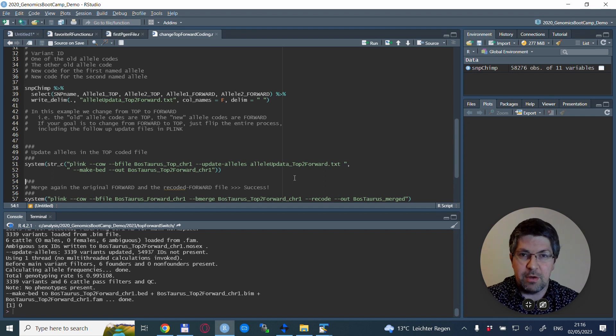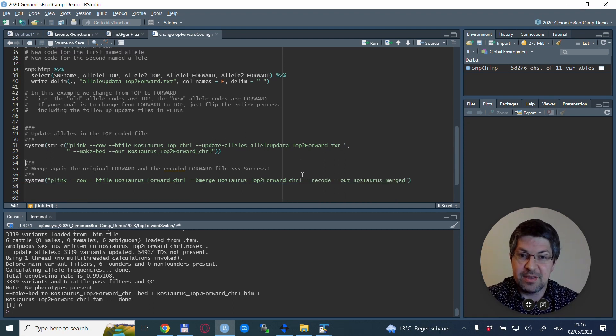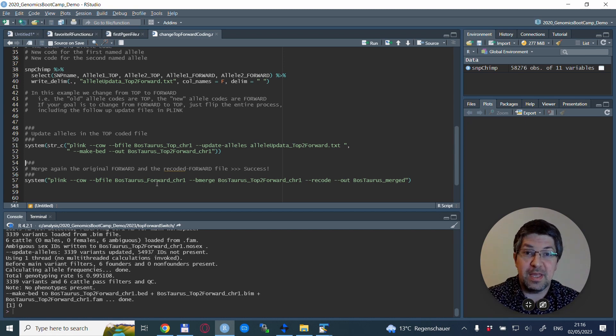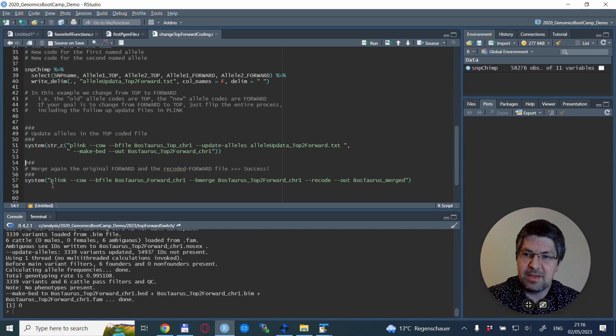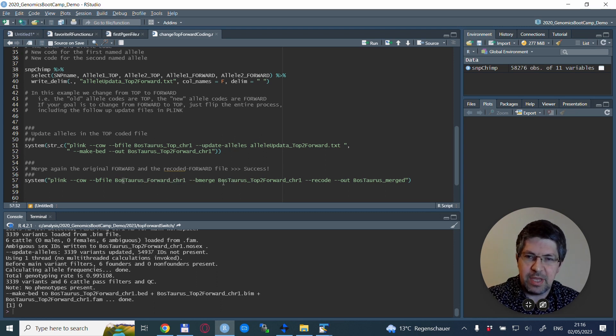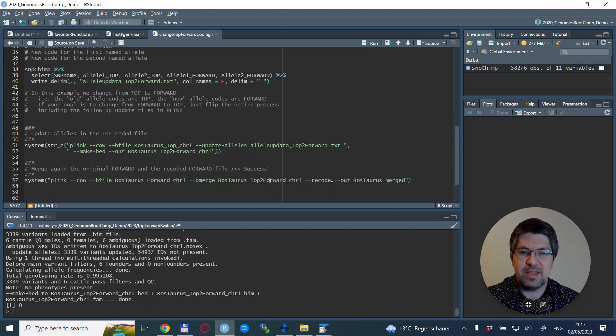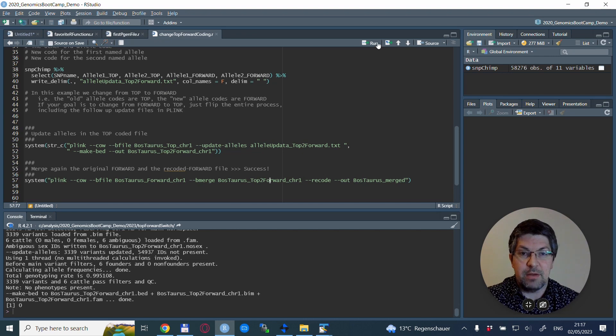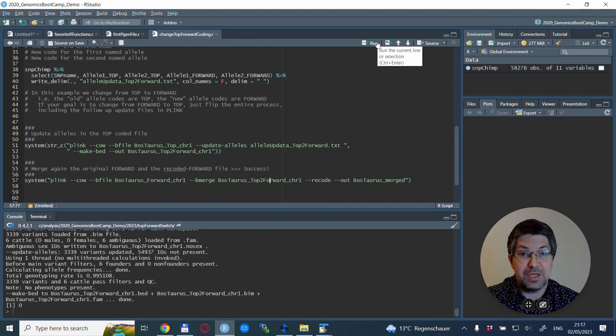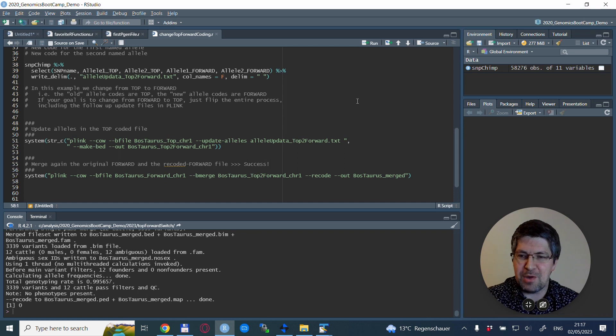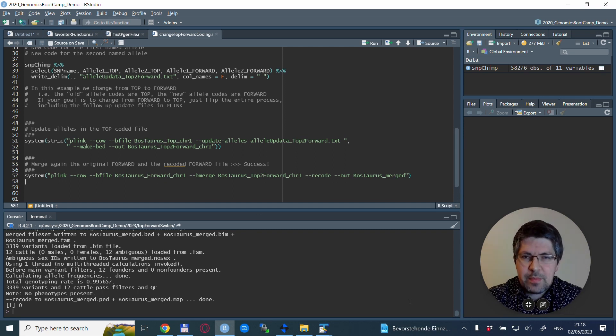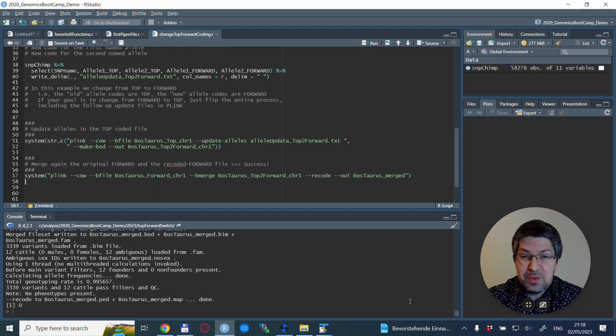Now we use the merge again with PLINK. We use the original forward coding and now this recoded file, this bostaurus TOP to forward chromosome one we just created. We run the merge which is now successful and without any problems. So this was it for this quick tutorial.